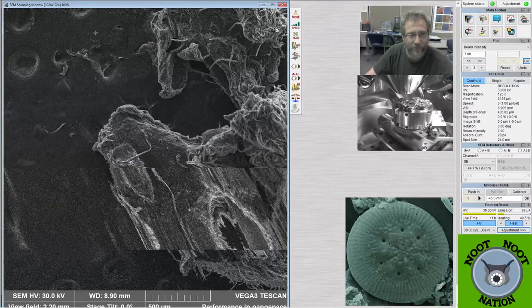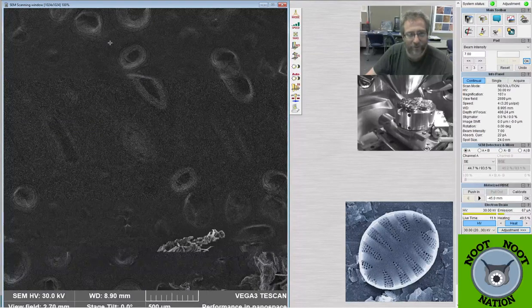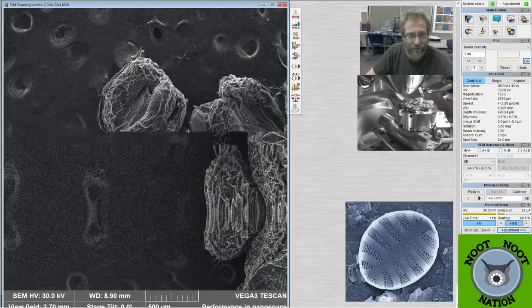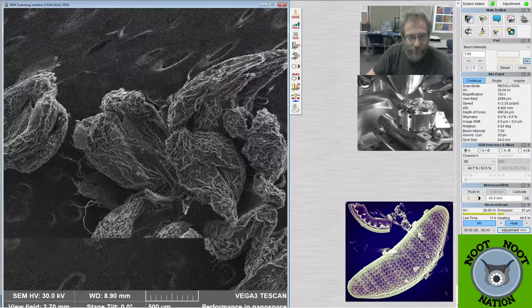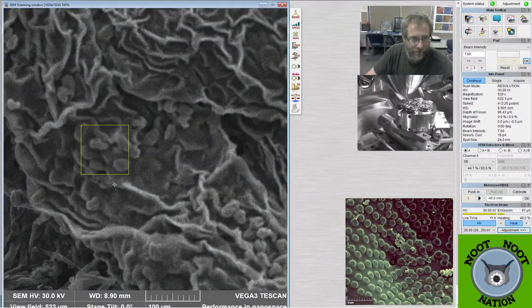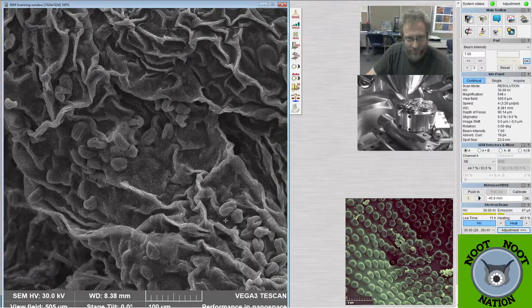And I'm going to look around and see if we can find the other one. I mean, it only goes so far in the stub. This is the other object that I smushed. And I think there's pollen on the surface of this, so whether I picked the right thing to look at or not is a question mark, but I think that's pollen. And it doesn't look like it's identical to the other one.